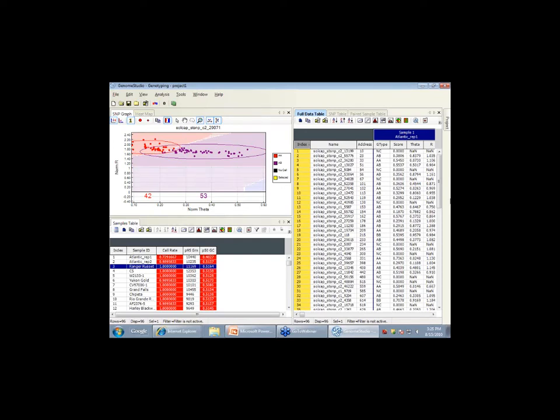We used the 3 varieties, Atlantic, Snowden, and Premier, but we also used the EST sequence and the genomic sequence that was available in the public as well. So there were old variety EST databases from Canonbeck, and then also the RH and the DM. So stay tuned for about 2 months, and you'll have the whole history and be able to follow where that SNP is really from. We'll have all that data on the SolCAP website link.